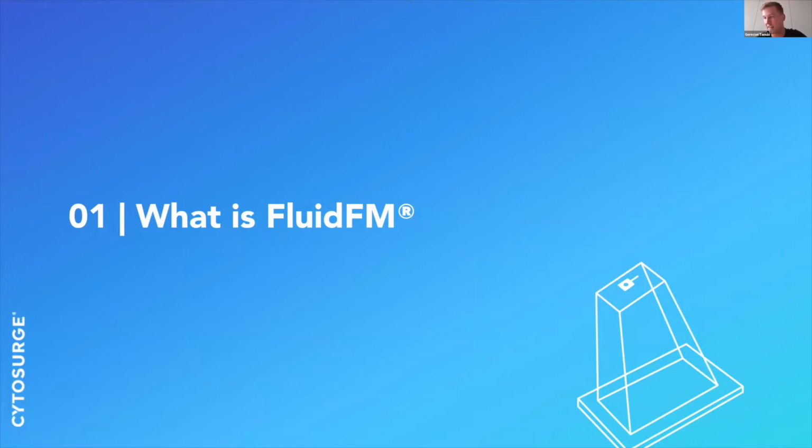I'm going to talk about fluidic force microscopy and how you can use it for CRISPR and also some omics. So there is definitely some connection there. And the first point that I would like to quickly introduce is what is FluidFM even.